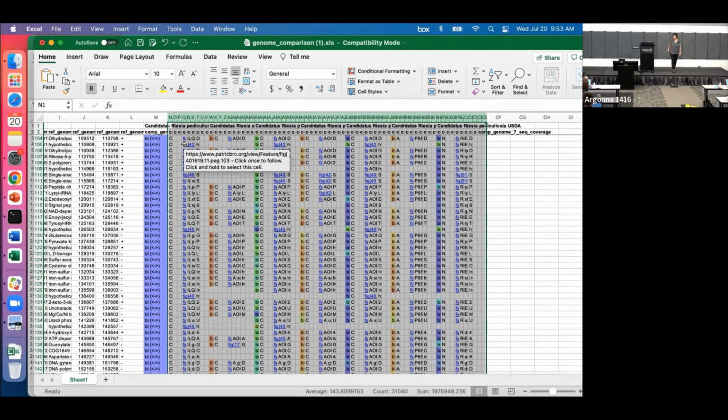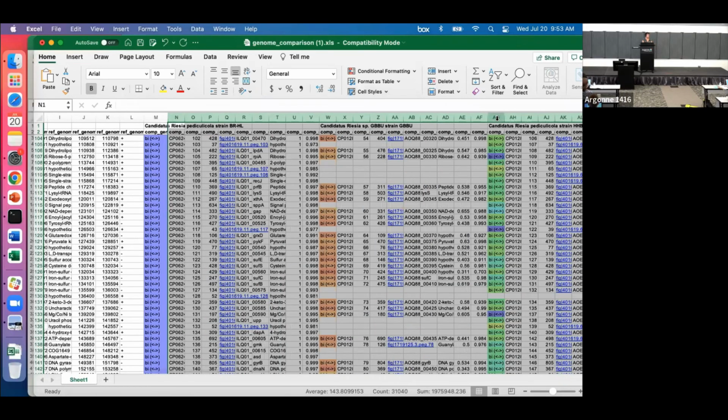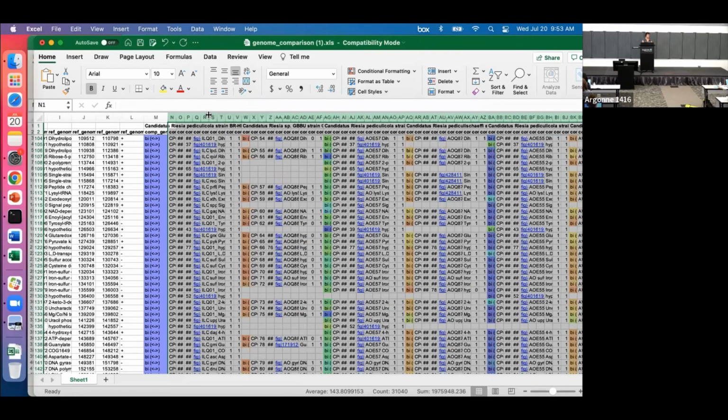How did I do that? See, they're all selected here. And when they're selected like this, I can go over the last one and change the size of it and shrink it up. See, it's those kinds of skills that have people thinking I'm a computer scientist sometimes with the Excel sheet, which I'm not. I just know how to manipulate Excel.